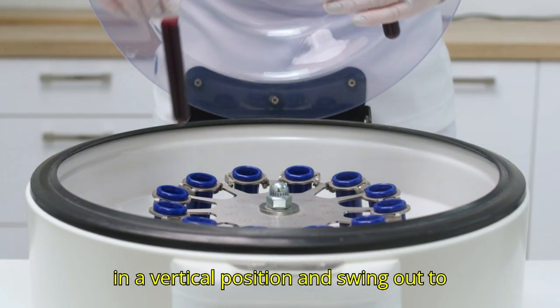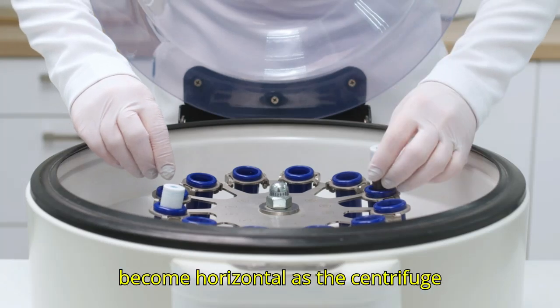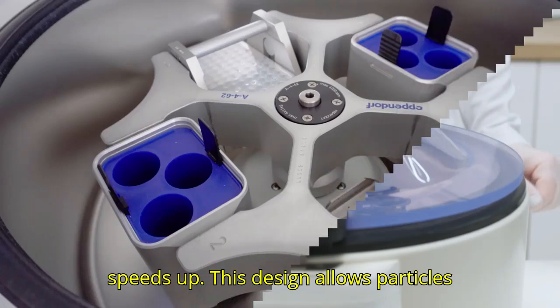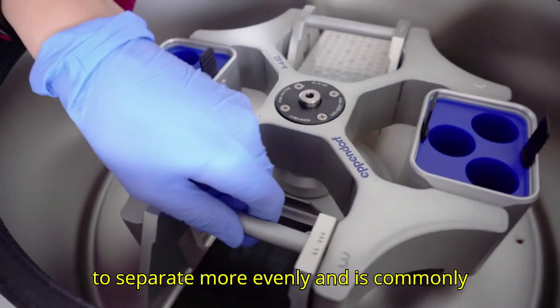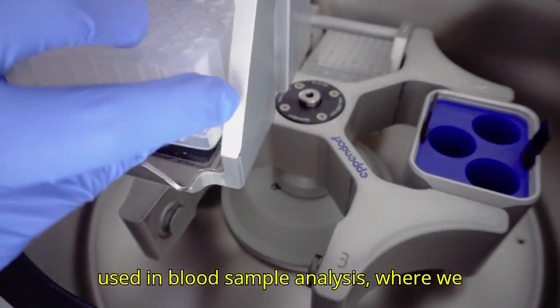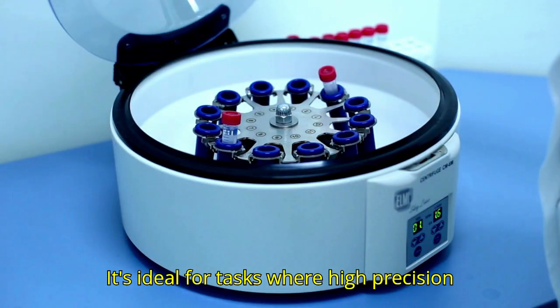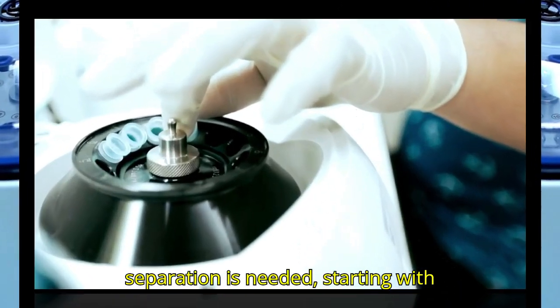Here, tubes start in a vertical position and swing out to become horizontal as the centrifuge speeds up. This design allows particles to separate more evenly and is commonly used in blood sample analysis, where we need clearer layers of plasma and cells. It's ideal for tasks where high-precision separation is needed.